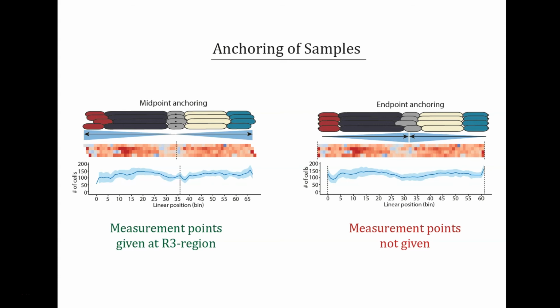The MP is used to align each sample in the full data matrix to reduce compounding error caused by proportional variation between intestines. If no MP is provided, each sample is joined to the matrix as is. However, it is nevertheless recommended to give the MP data to maximize biological correspondence of regions within the data matrix.